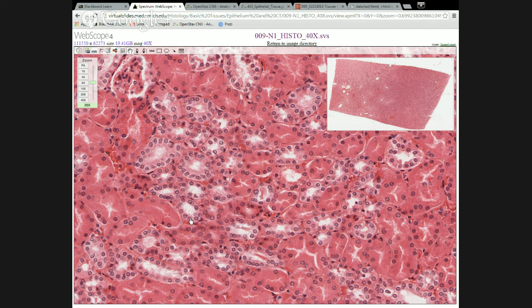And at this magnification, it's not possible to always see those little lines here, but we can imagine where it would be. Like, okay, here's a really good example. We have two epithelia sort of squished up next to each other, and we can see a pretty good line between them.